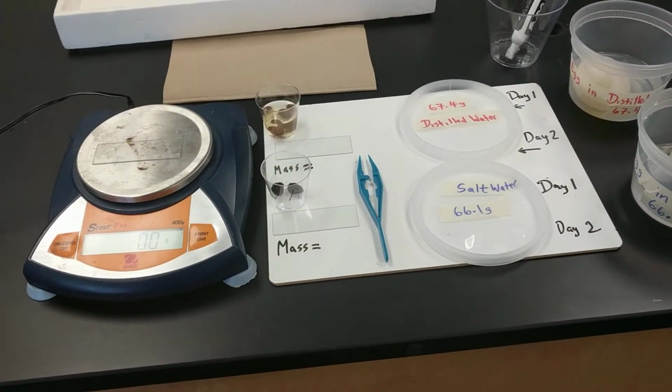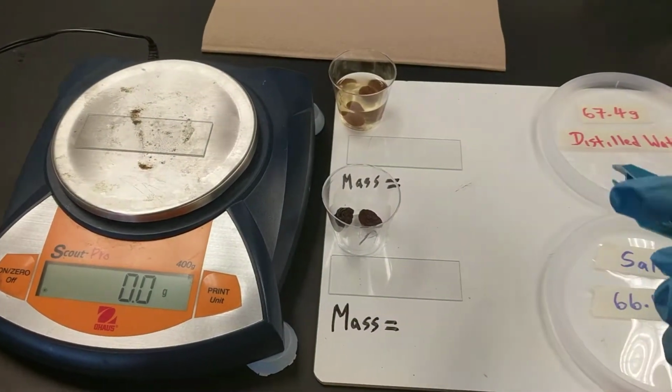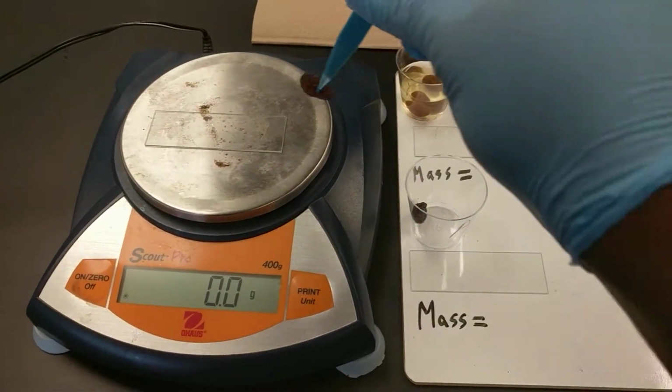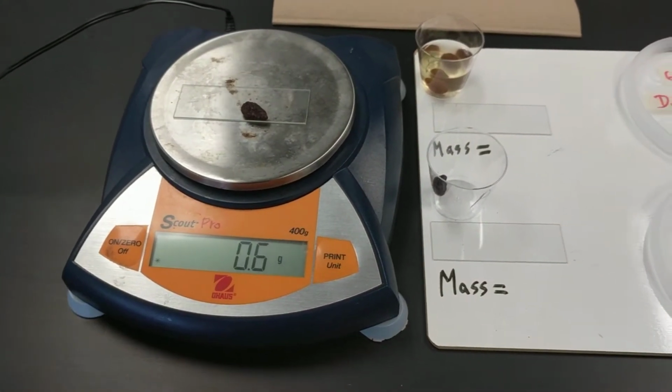Day 2 of our experiment. We want to determine the mass of the dry raisins. 0.6 grams.